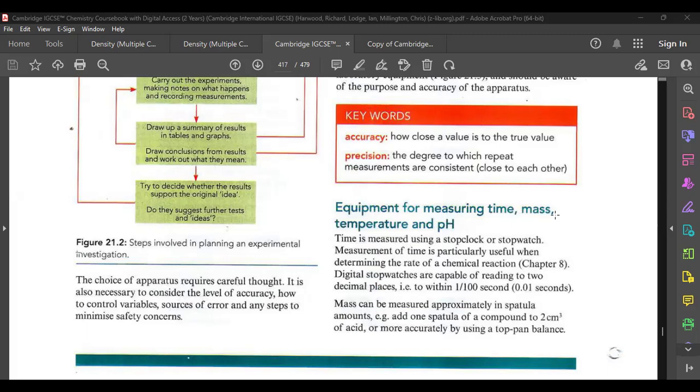Obviously, after some time, it shows the reading of 44 degrees Celsius or 45 degrees Celsius, the maximum reading. But the water is still boiling up. If the water is still boiling up, then what is happening?